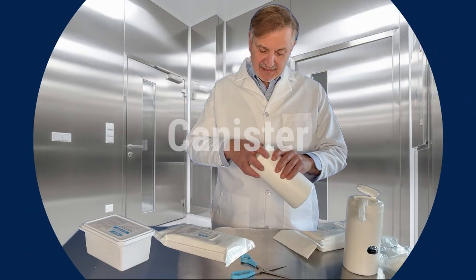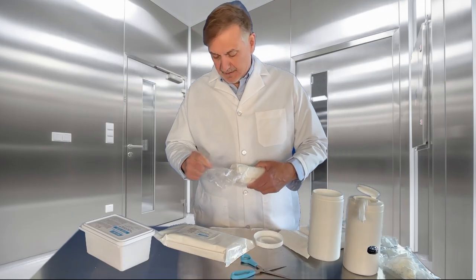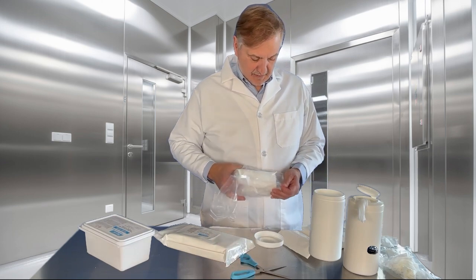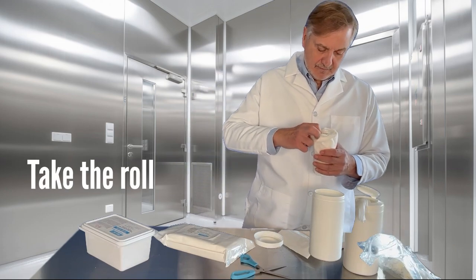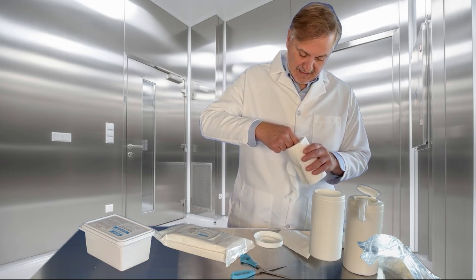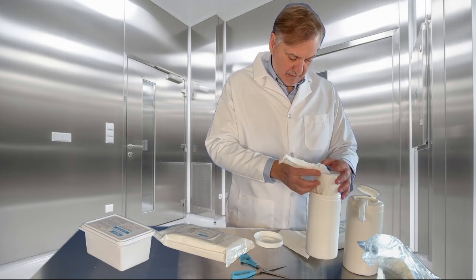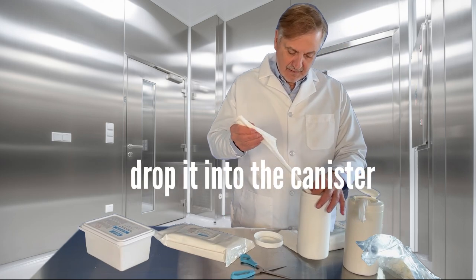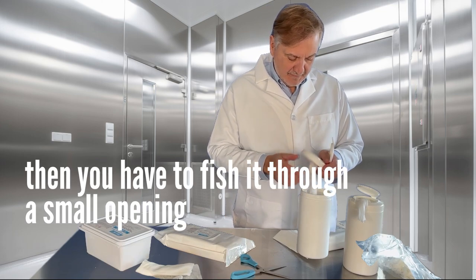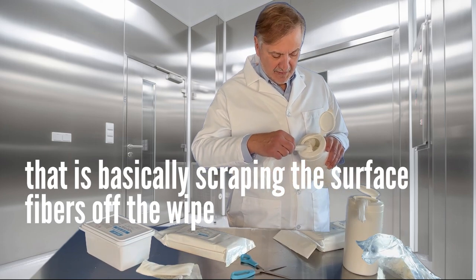The first type is the canister type. If you're familiar with these, you have to pry open the top, pry open a bag, take the roll, and before you put it in, you've got to try and fish out a tail from the center, which is very difficult to do. You usually end up with a clump like I'm doing right now. Drop it into the canister — pretty much have to throw those away — then you have to fish it through a small opening that is basically scraping the surface fibers off the wipe.